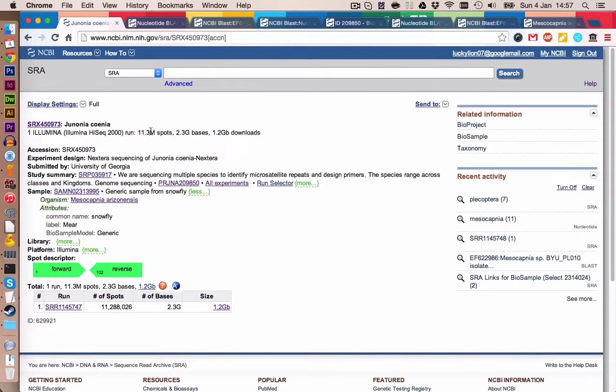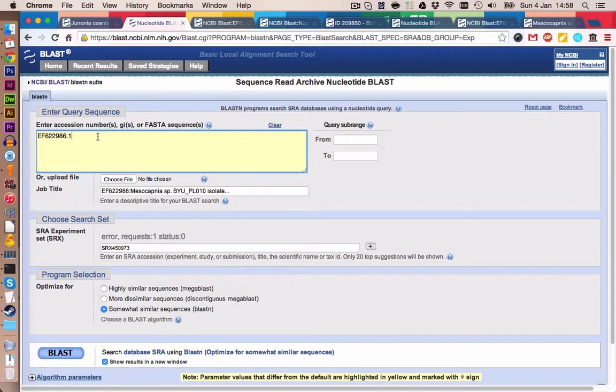We have here the files which we downloaded in the last tutorials. I was assuming this is a stonefly, but there was a problem — the name of the species shown is a butterfly, while the taxonomy lists the stonefly we want to work on.